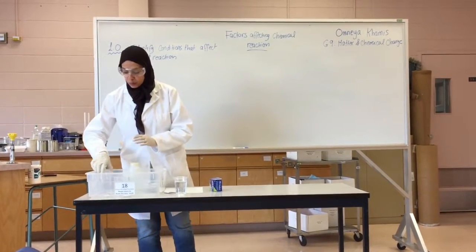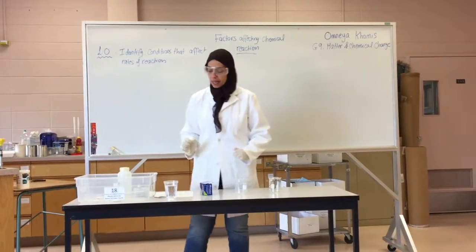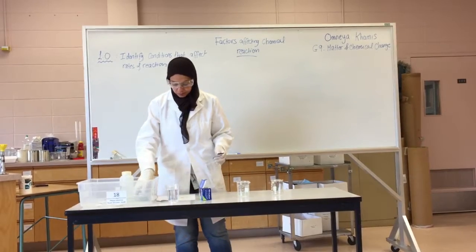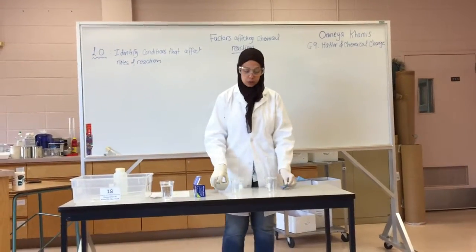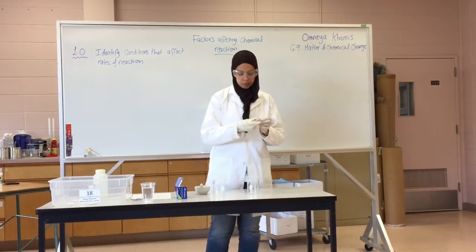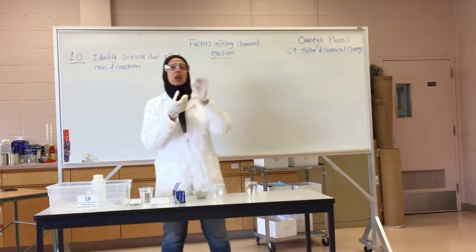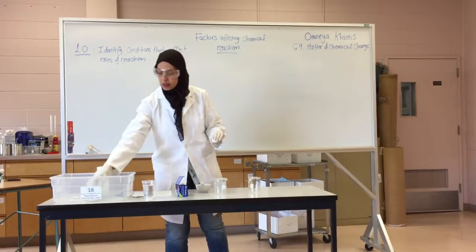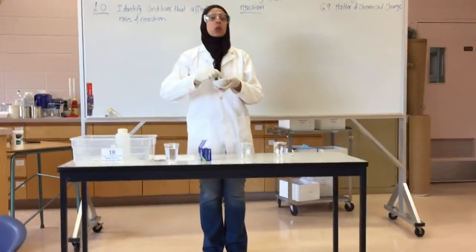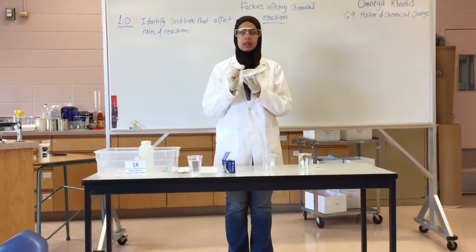First of all, we will get 2 clean beakers and I will have my medication here. What I'm going to do is take a tablet. This is a whole tablet. I will put it in here. And another tablet, I crushed it using these lab equipments.